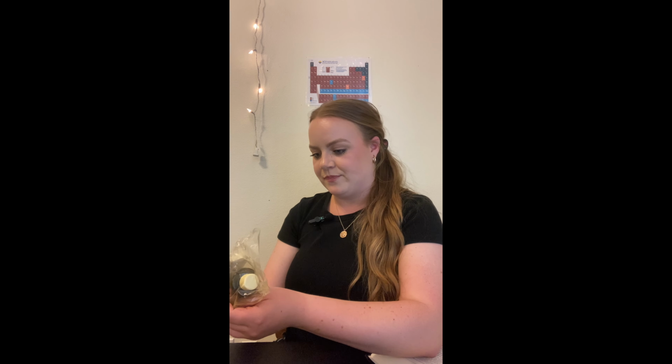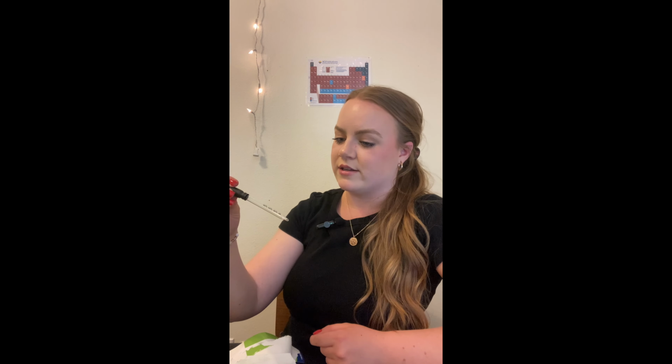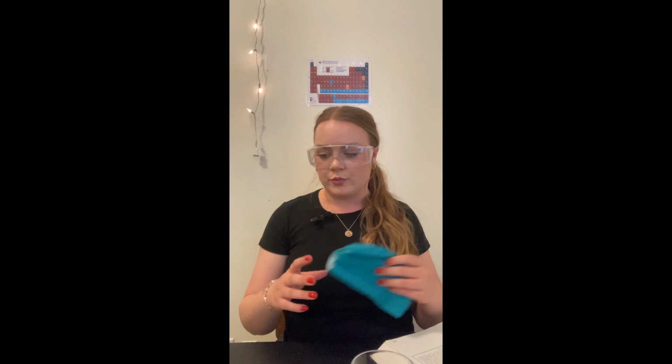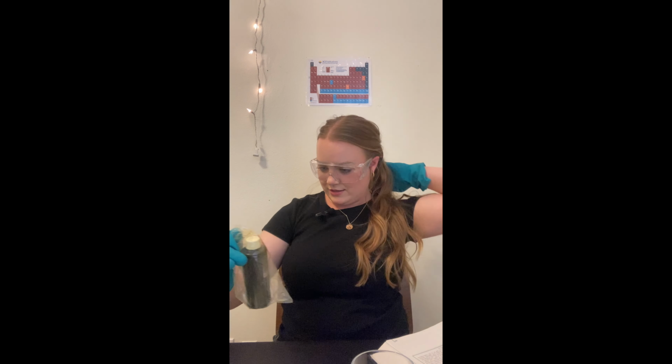It's lab grade. There's 100 mils of the solution. And then what I'll be utilizing is just a medicine dropper, brand new, to transfer the solution. This is what the dropper looks like. It's medical grade, so it goes up to 1 milliliter. I will be using additional personal protective equipment besides my goggles. I really do not want to get this iodine on me, so I have dish gloves. Perfect. At home, kids, this is not a good idea.